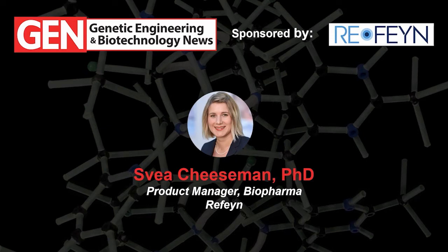Svea has a background in single molecule biophysics and a very keen interest in pushing the boundaries of biomolecular analysis to eventually enable real-time release of biomolecular drugs. Now today, she is going to tell us more about Refeyn's novel mass photometry instrument, as well as provide data proving its ability to reliably quantify the empty-full particle ratio for different AAV serotypes and at different purification levels.